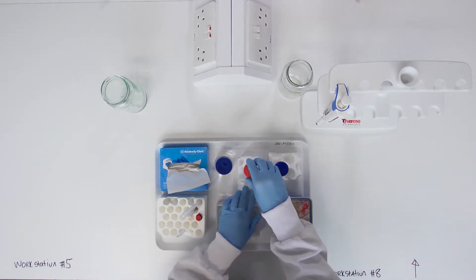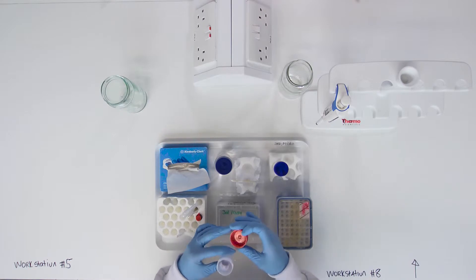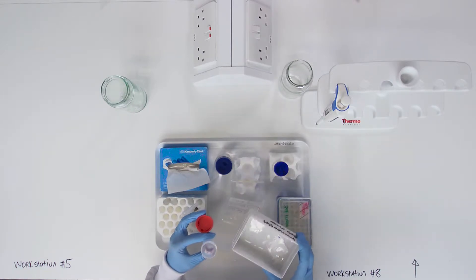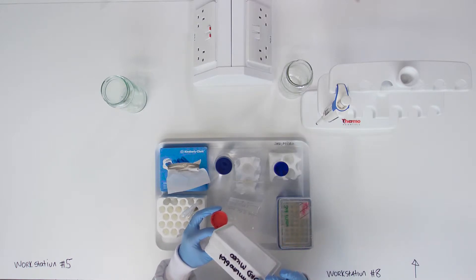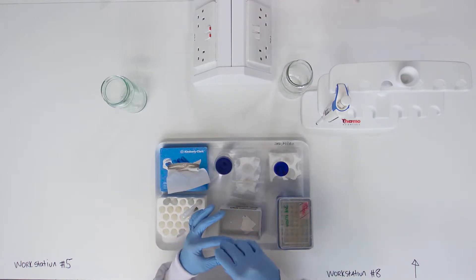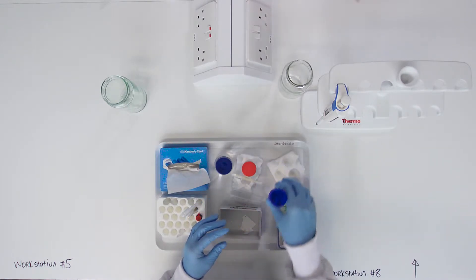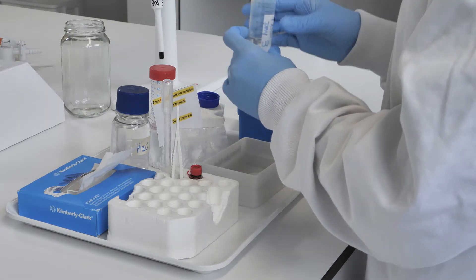Pour the antibody solution back into its original container. Wash the membrane twice in 1x TBS.